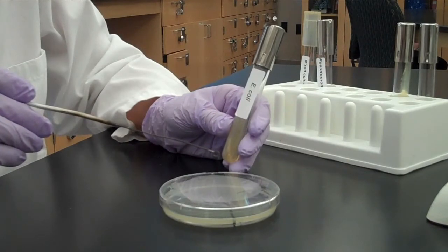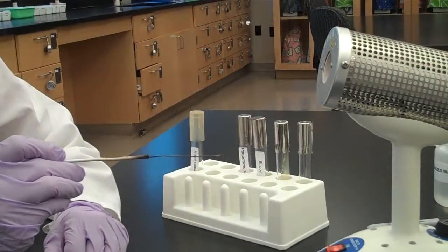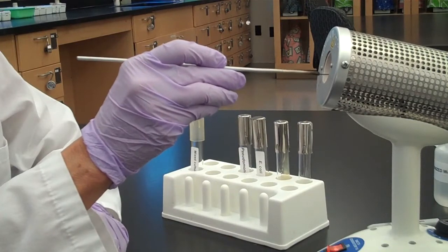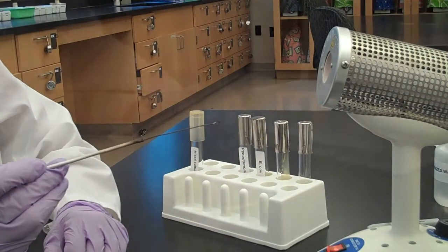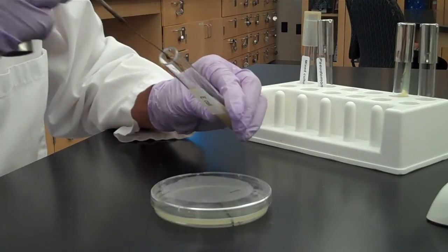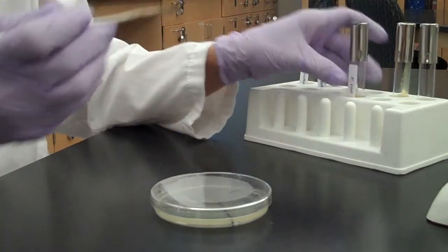Now we're going to demonstrate the streak plate of a pure culture of bacteria. We're going to use the loop for the entire streak plate. Sterilize your loop and let it cool. Take a pinpoint amount of bacteria off the slant and inoculate the first section of the streak plate.